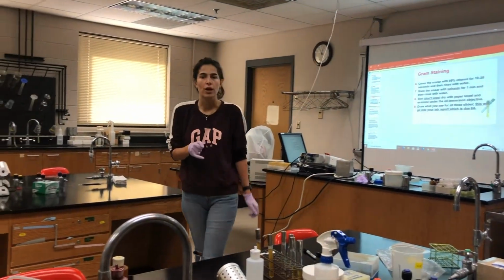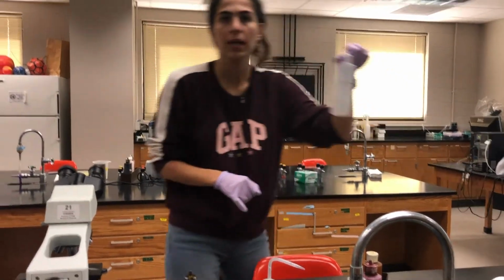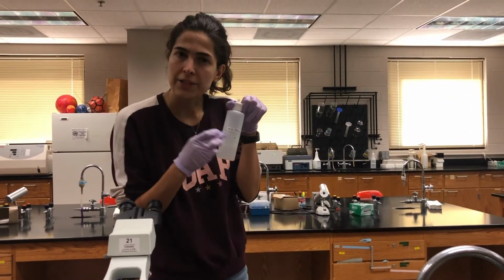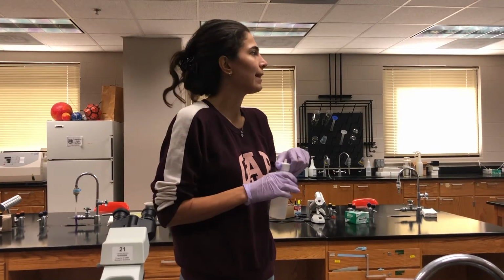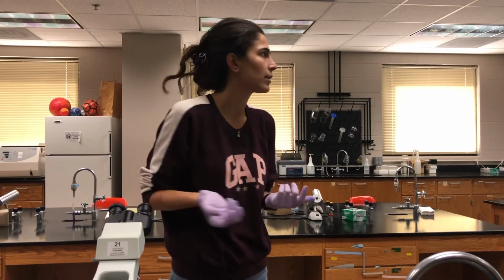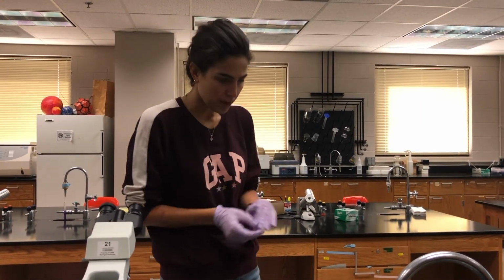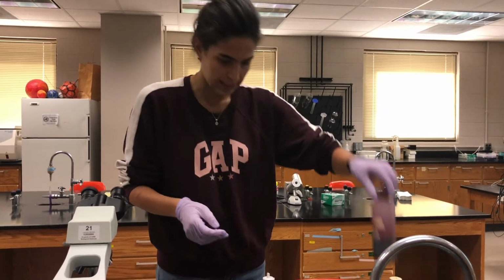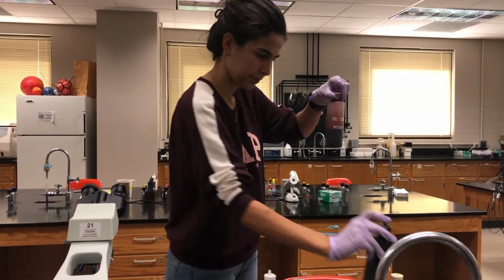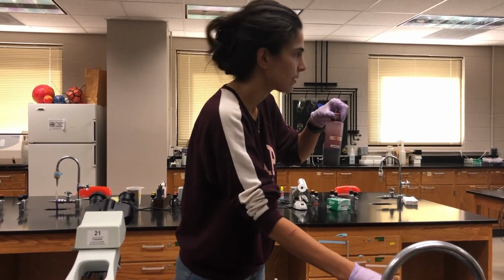we need to cover the smear with 95% ethanol, which is the decolorizing agent step, and then we need to wait for 10 to 20 seconds and rinse it with water again. Then stain the smears with safranin. Here is the safranin for 1 minute, and then rinse it with water.